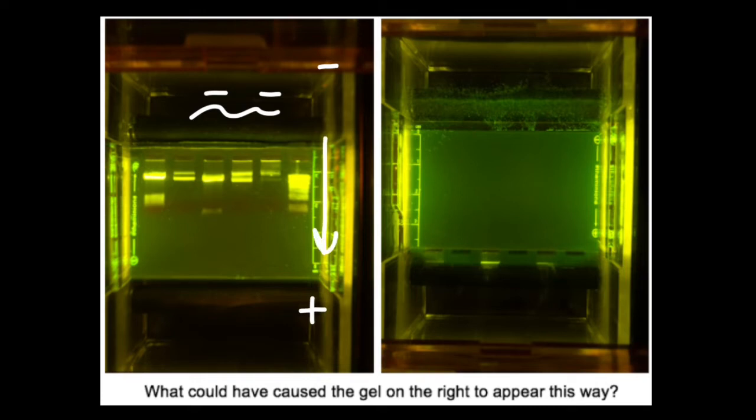Along this way, these bands would separate according to their size. The smaller molecules, the faster they move. Larger molecules would move slower. What happened to the gel on the right?